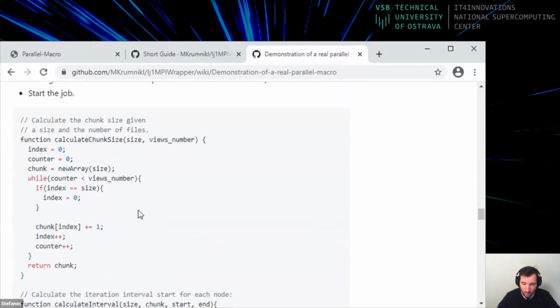And now I would like to show you the parallel code, and I will simply highlight and explain only the parts that we needed for the parallelization. You will recognize many of them from the previous 2 examples, and there are some additions for splitting the work: splitting the loop, splitting the views into groups, so that each compute node will execute its part of the operations required for a view.